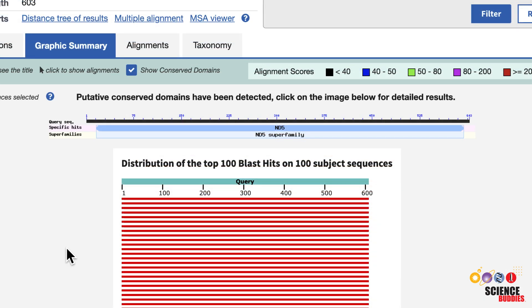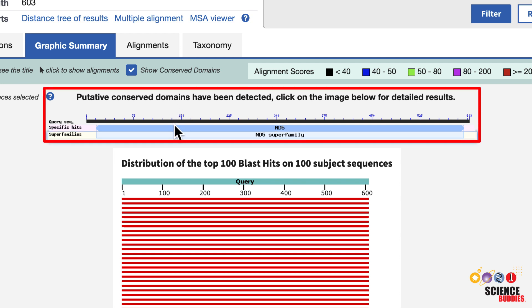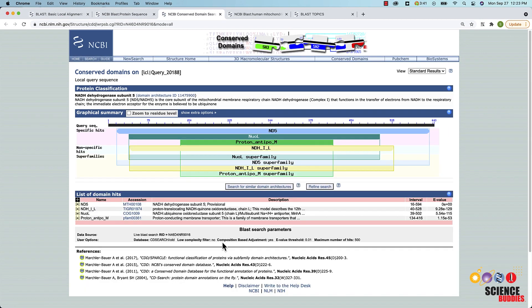If you search for a protein sequence, the graphic summary report also provides a graph that shows putative conserved domains within your query protein. If you click on the image, you can learn more about each of the detected conserved regions in your protein.